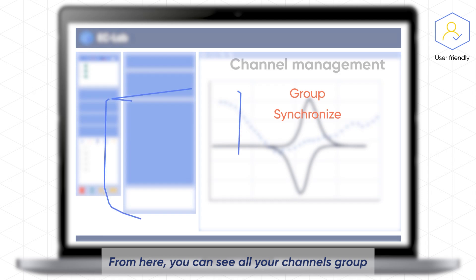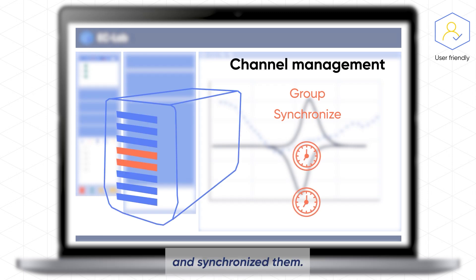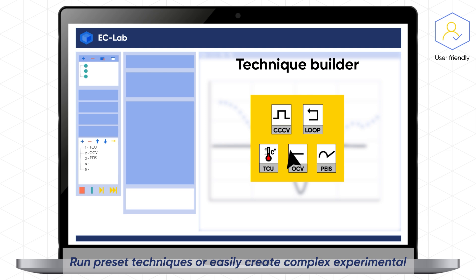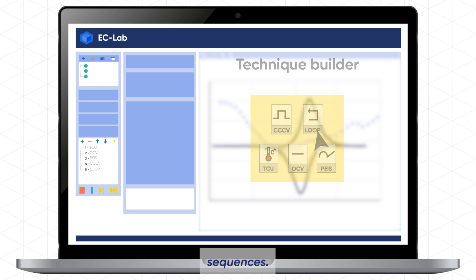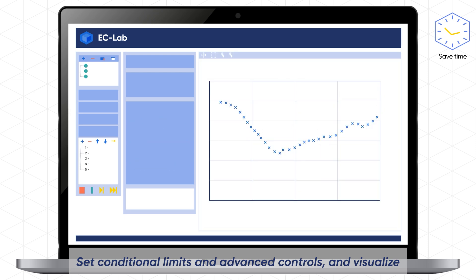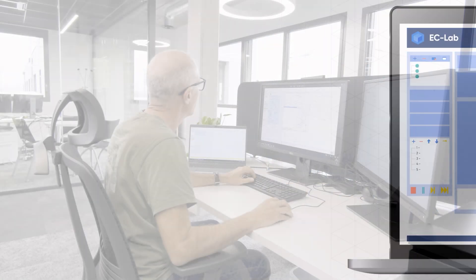From here you can see all your channels, group or synchronize them, run preset techniques or easily create complex experimental sequences, set conditional limits and advanced controls, and visualize and modify your settings while your experiments are still ongoing.